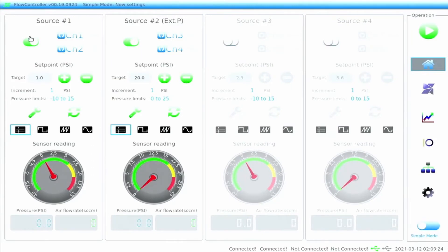In the on-off zone, users can toggle the pressure source for each of the four sources as well as toggle on or off individual channels, and the number next to the channel shows the duration of on time. A reminder for the user is that only pressure sources 1 and 3 are capable of providing vacuum.